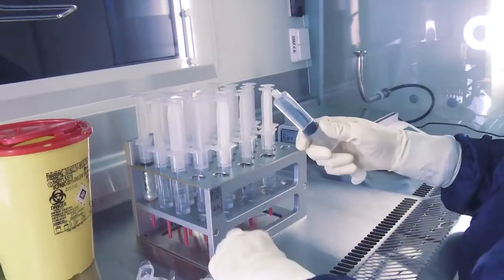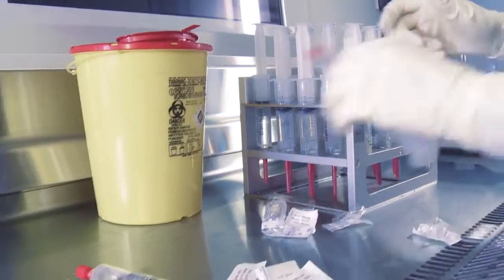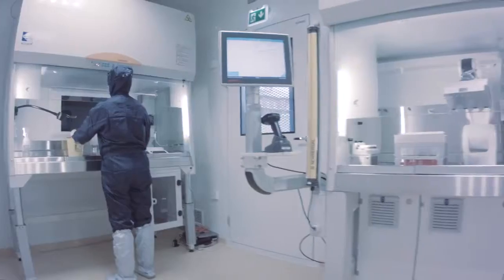The user may finalize the batch and prepare the next one while the robot continues compounding.